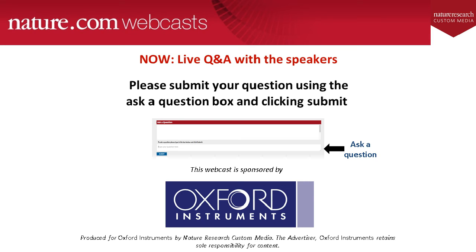Excellent. Thanks, Erin. And our next question is for you, Louise, and this one asks, what challenges do biological samples pose for EDS? Thank you. A lot of the challenges are similar to the challenges biological samples pose for EM in general, in that they are non-conductive.